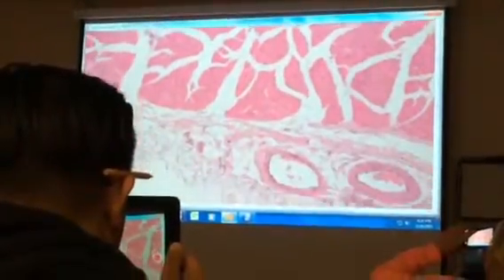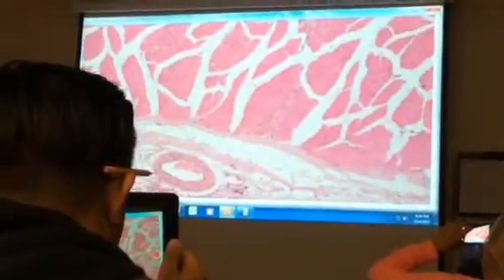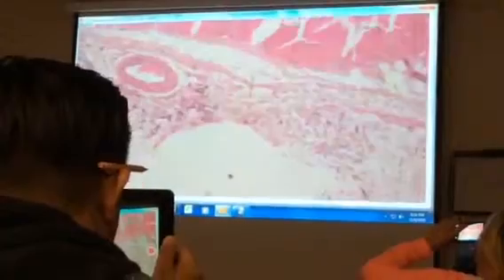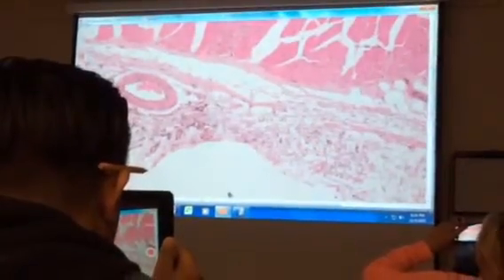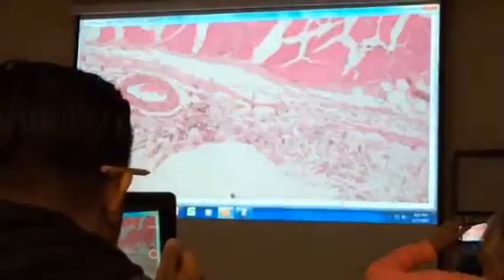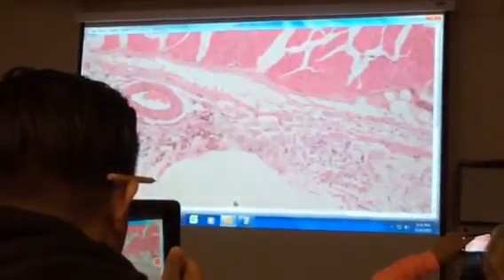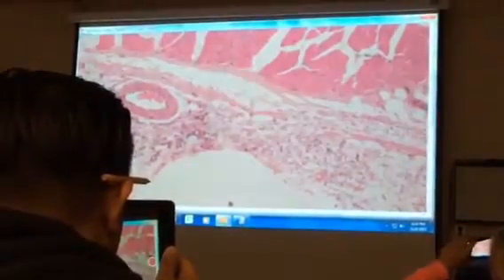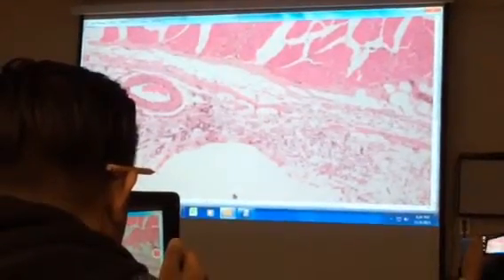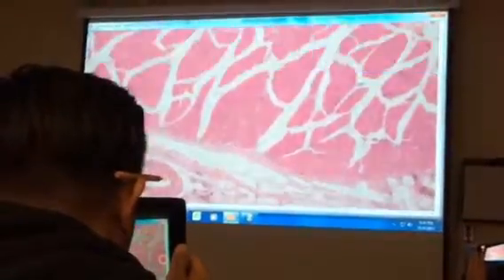Okay, and then we go all the way out. We've got some big blood vessels down there at the bottom, a couple of arteries, an artery and a vein actually. And we go down here. Muscularis externa ends right about in here. And then we've got, what's this outer layer of the esophagus called? Starts with an A. Adventitia, yes. So this is the adventitia. It's a pretty thick one, like that. And then lots of collagen fibers in there. That's that dense fibrous connective tissue.